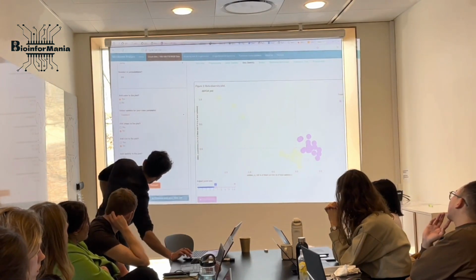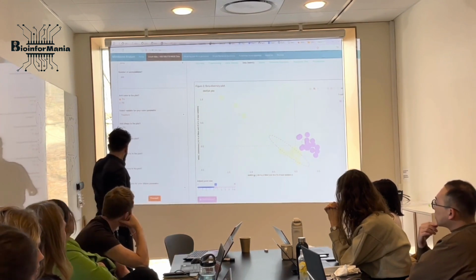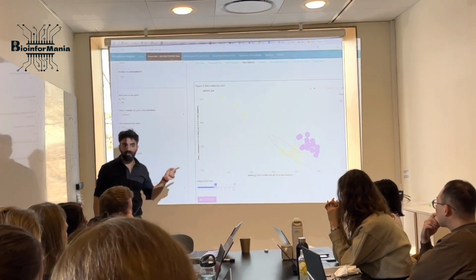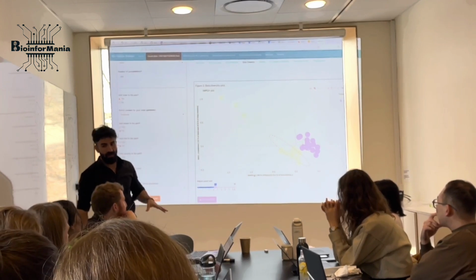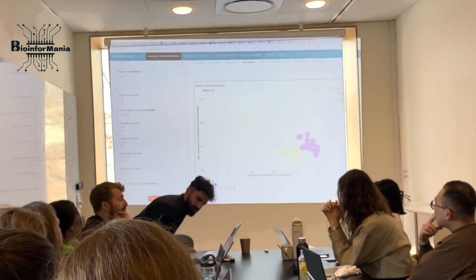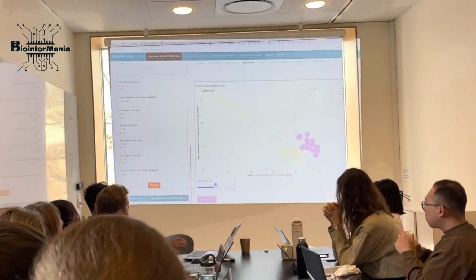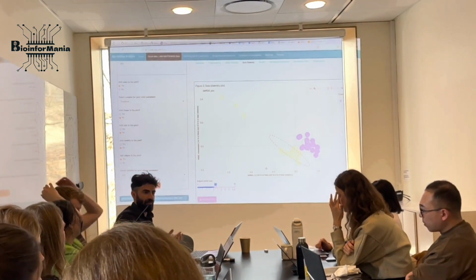If you also want to have them a little bit more visualized, you can add this ellipse down here. And then voila. This is beautiful. Use it if you know that there are some confounding factors in your data and you don't want their effect. You can do distance-based redundancy analysis or redundancy analysis. Good. Now we are done with this. Now we know that treatment definitely has an effect on this microbiome data.